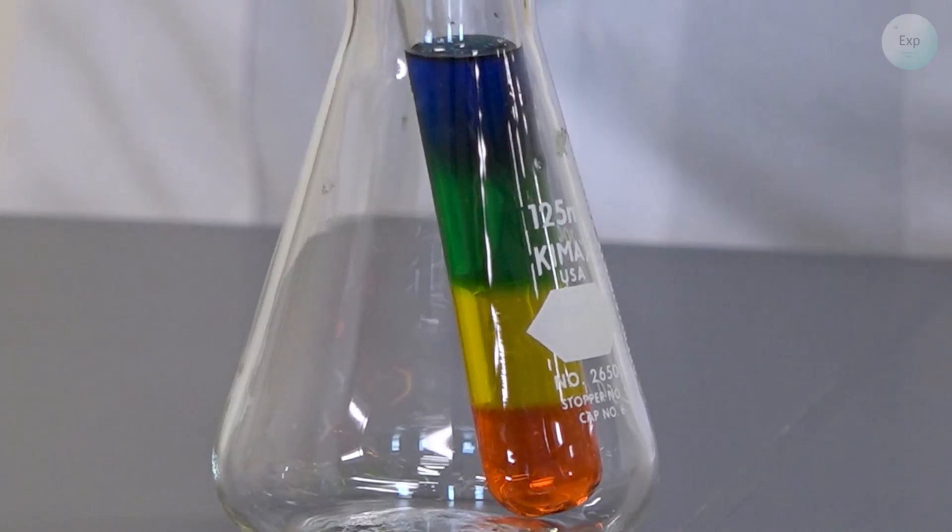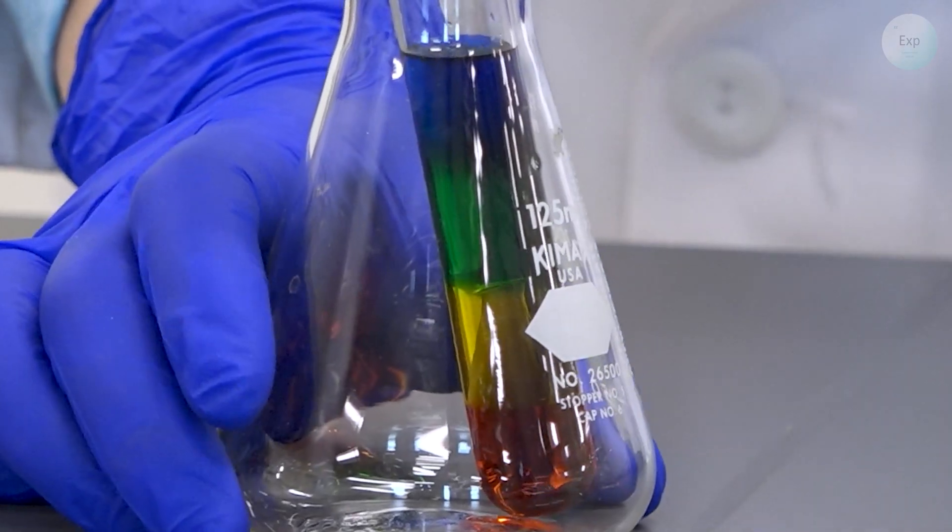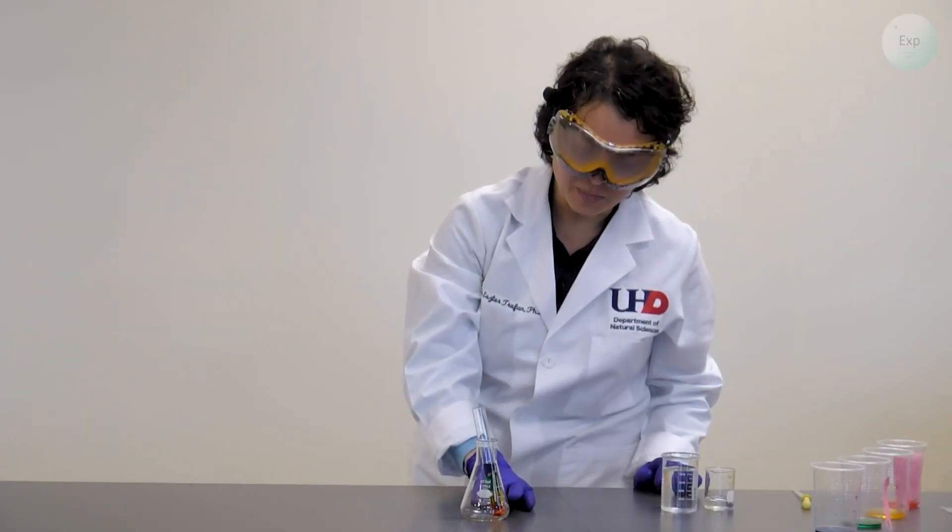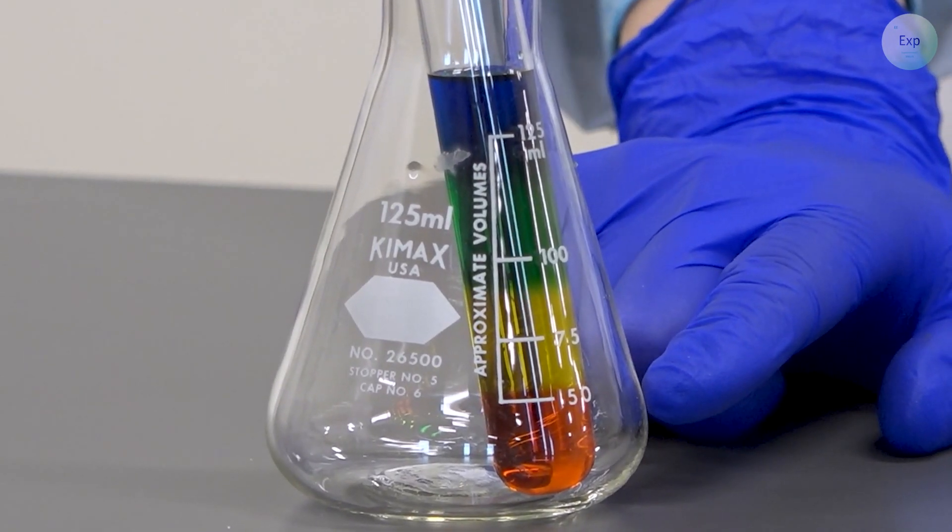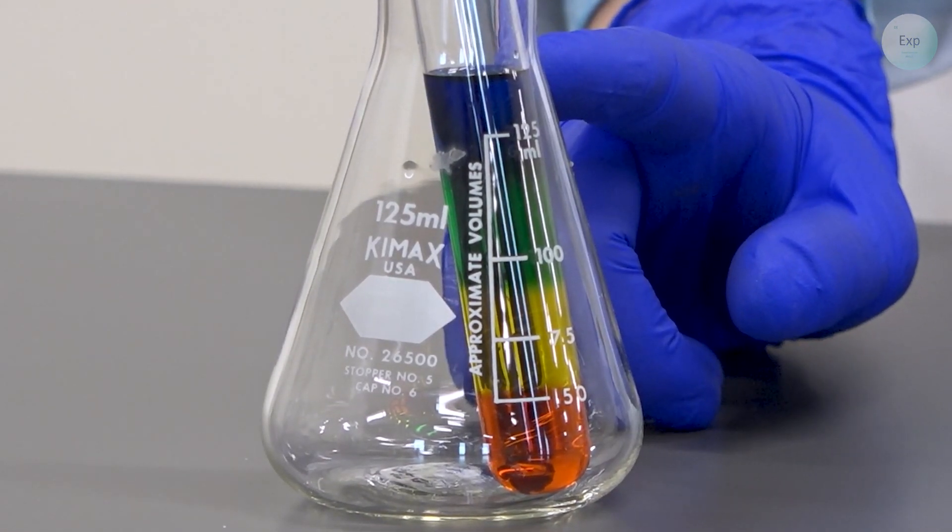And with that, we have our four layers inside the test tube, and they are all clearly identifiable. We have the red-orange on the bottom, then we have the yellow, the green, and then the blue at the very top.